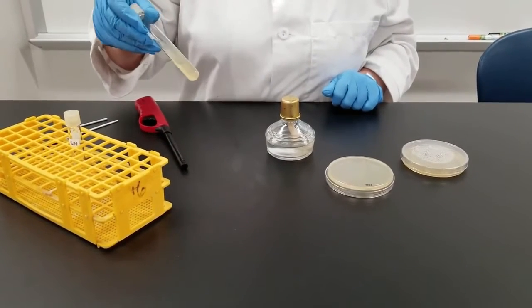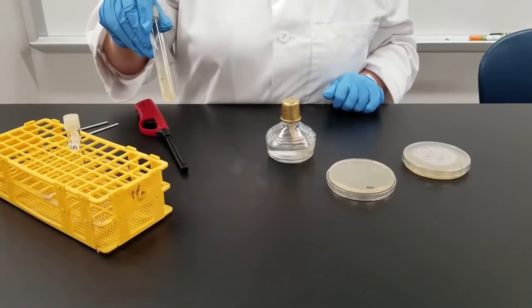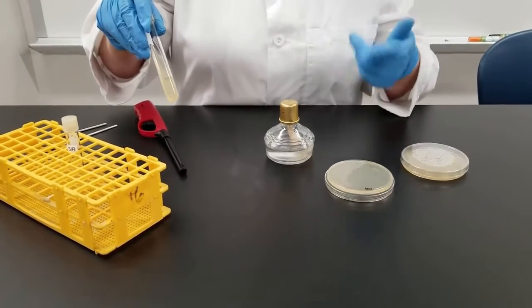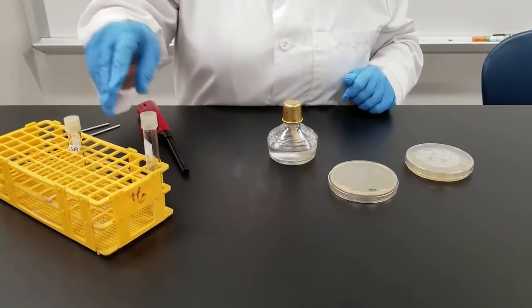Sometimes we will grow them on what we call a slant, where you've got the agar. In the agar you can make different types of nutrients added to it. So this would be a slant and you can inoculate that.